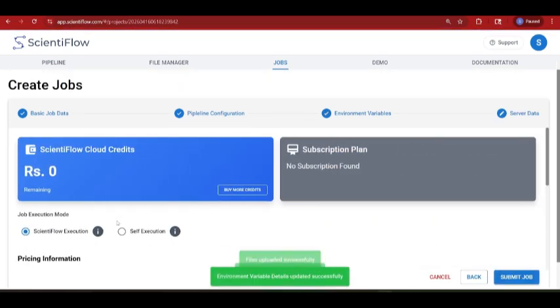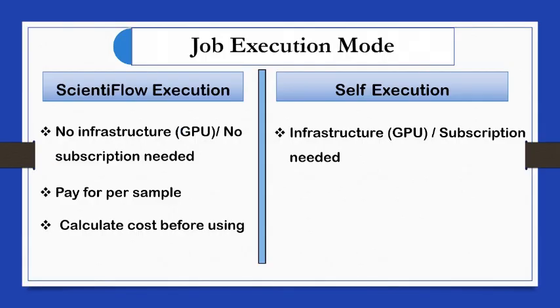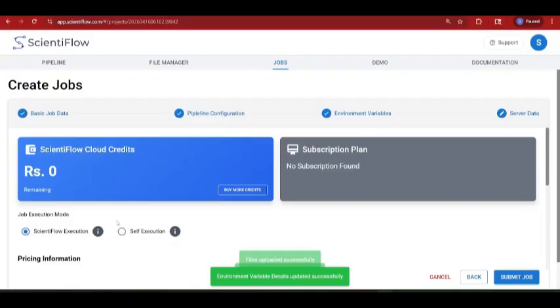You will have the option to choose the mode of execution. We provide 2 modes, Scientiflow Execution Mode and Self-Execution Mode. In Scientiflow Execution Mode, you don't need a GPU-supported system, and you only pay per sample you run. Whereas in Self-Execution Mode, you require a GPU-supported system and an active subscription to run your jobs. For this demo, we will proceed with Scientiflow Execution Mode. For all the docking workflows demonstrated here, make sure to select the Scientiflow Execution Mode.